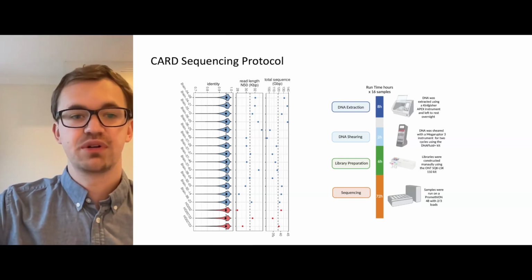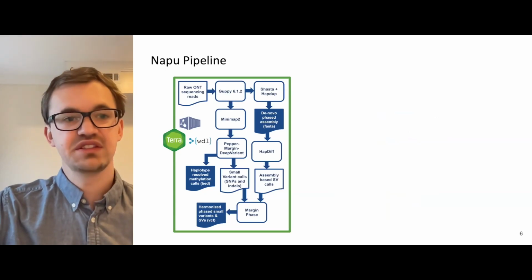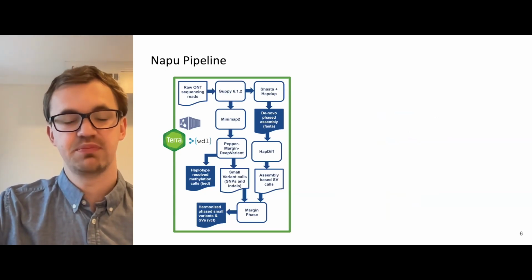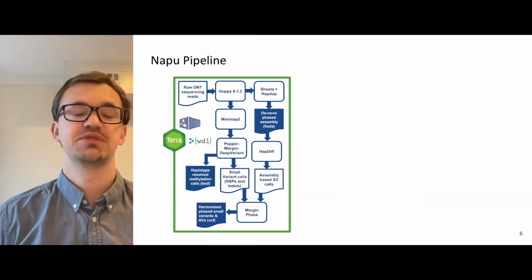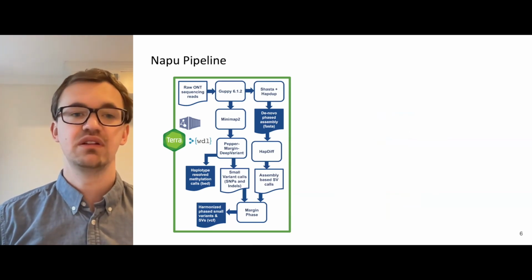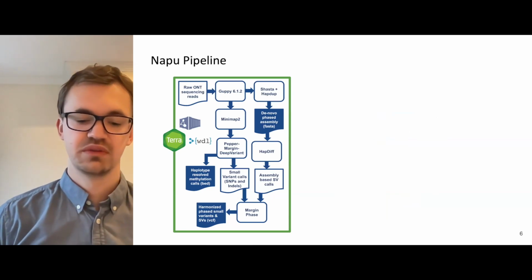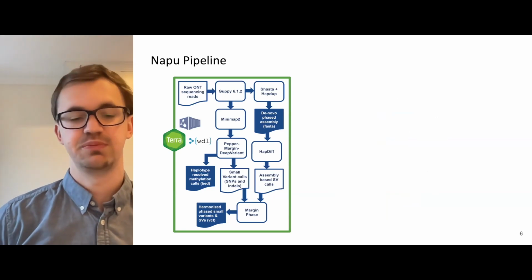So here, this is the protocol, and this is how we analyze this data. This is the Napu pipeline. This pipeline has been written in WDL, and it runs on Terra in the cloud, but it's also really easy to run it on a computational HPC server.